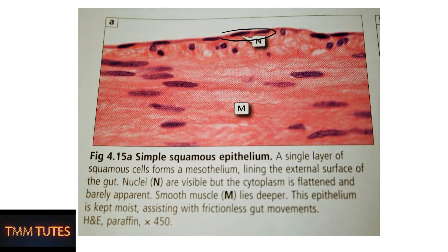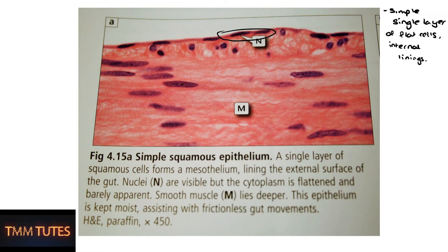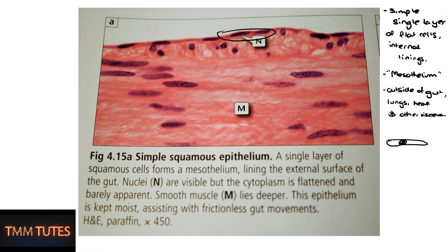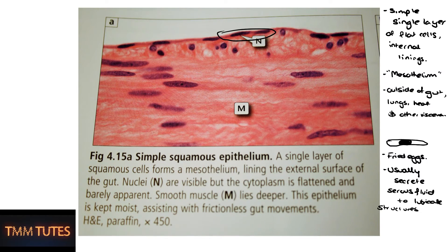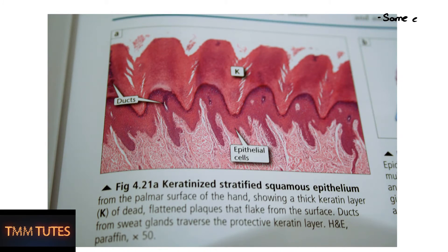Here we have simple squamous epithelium. Simple squamous — a single layer — is usually found on internal surfaces along organs like the heart, lungs, and other viscera, and can be called mesothelium. The squamous cells can be difficult to see; they sort of look like a fried egg cut in half — a long thin cell with a big flattened nucleus. In these mesotheliums they often secrete a serous fluid that lubricates the organs in the compartments they lie in.